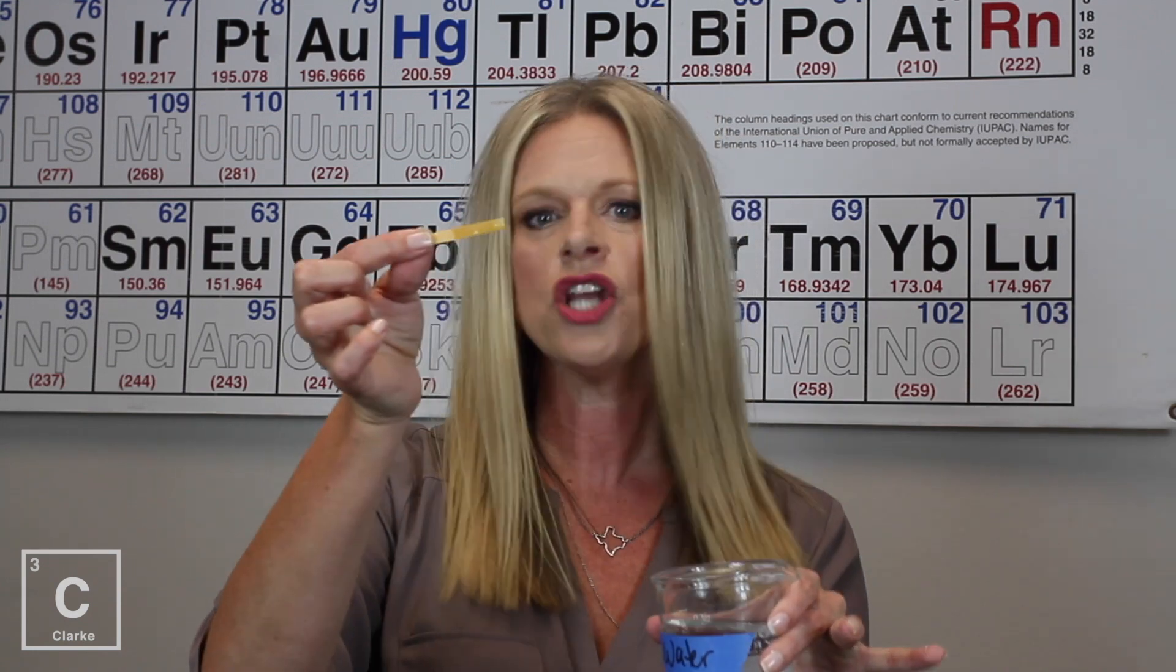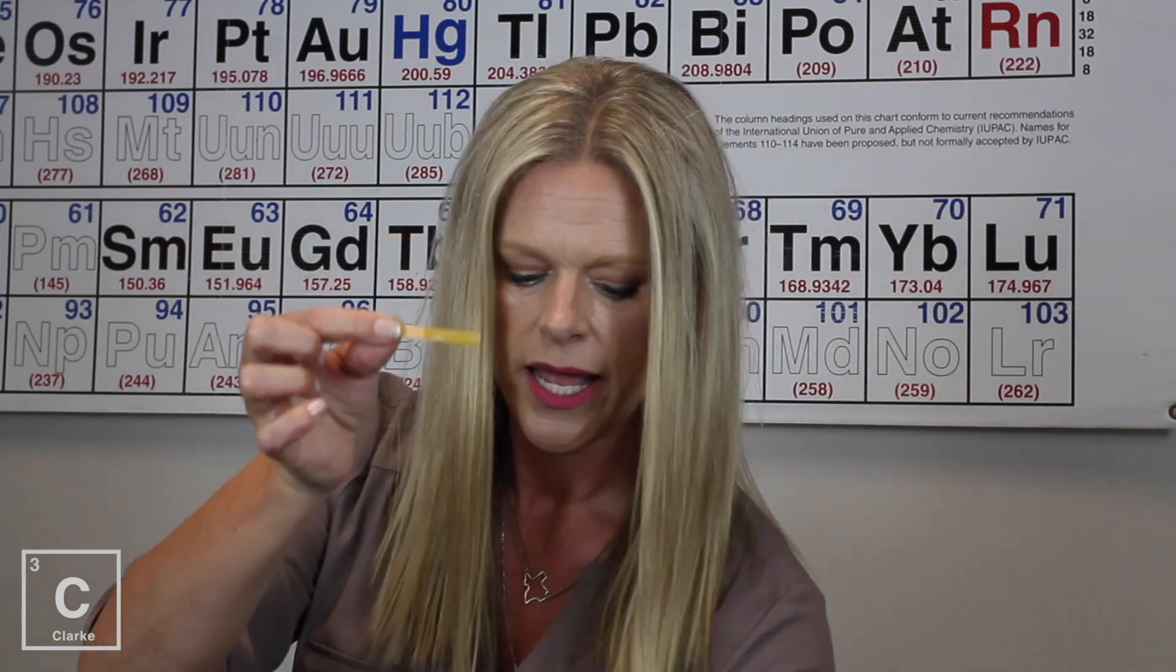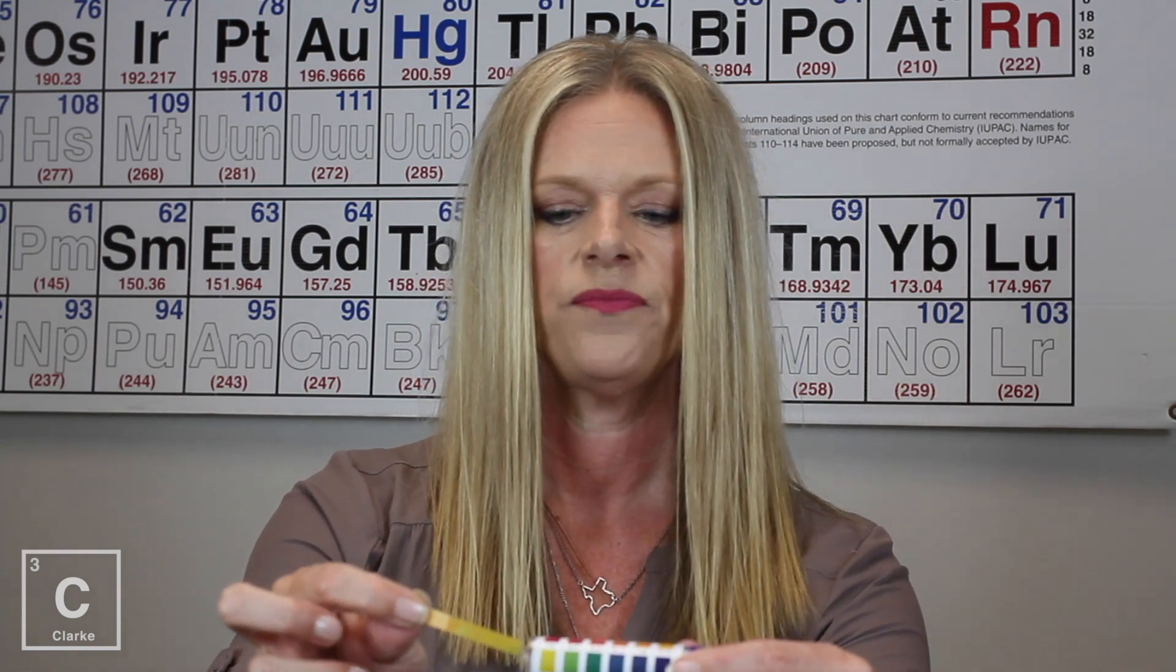Also, this neutral solution water should have a pH of 7. Now that's pure water, and I have tap water here, so let's hope that it shows that pH of 7. Did not change my indicator paper, and when it does not change the indicator paper, we can see that's going to be the 7. Water has a pH of 7. It is neutral.